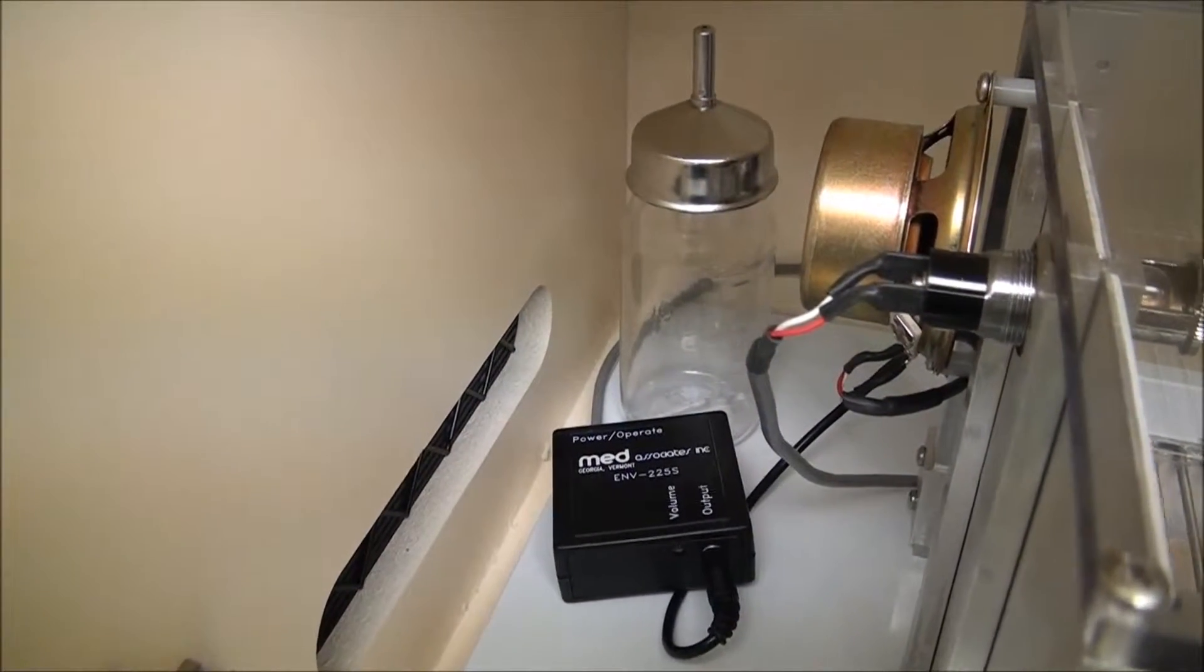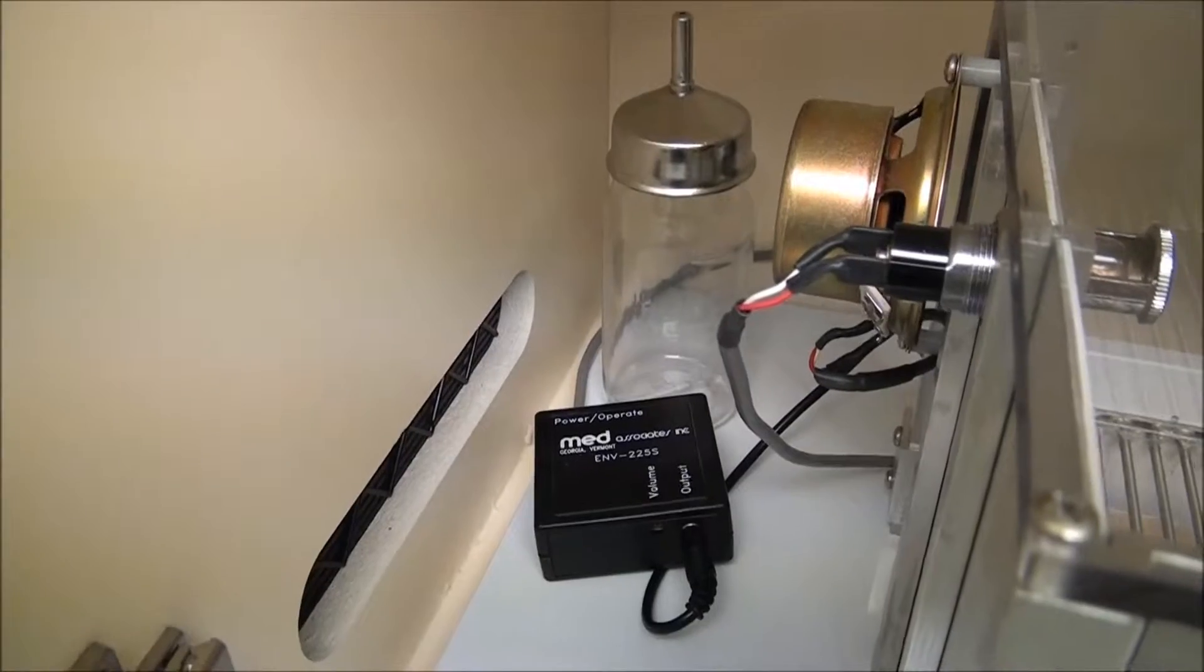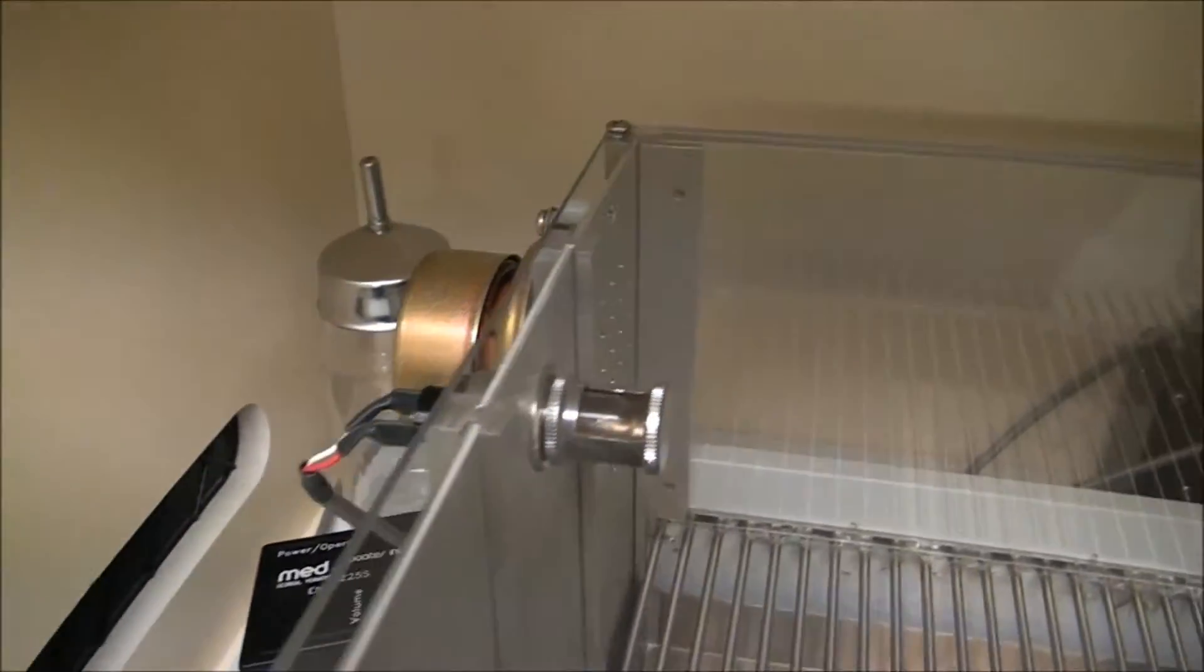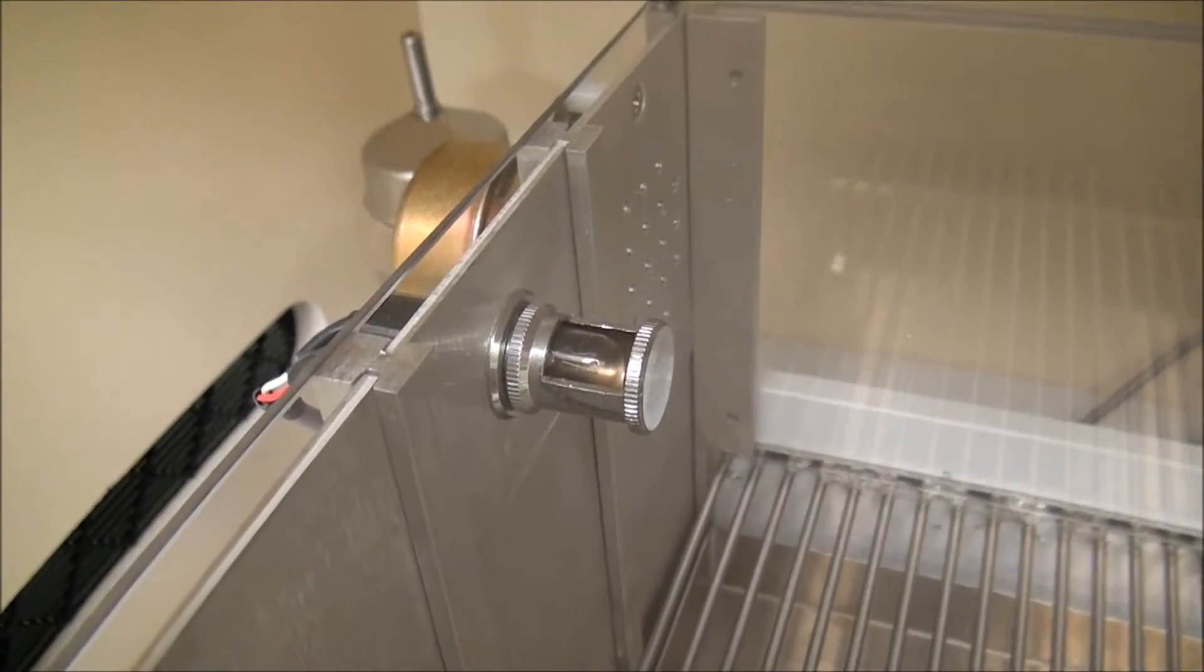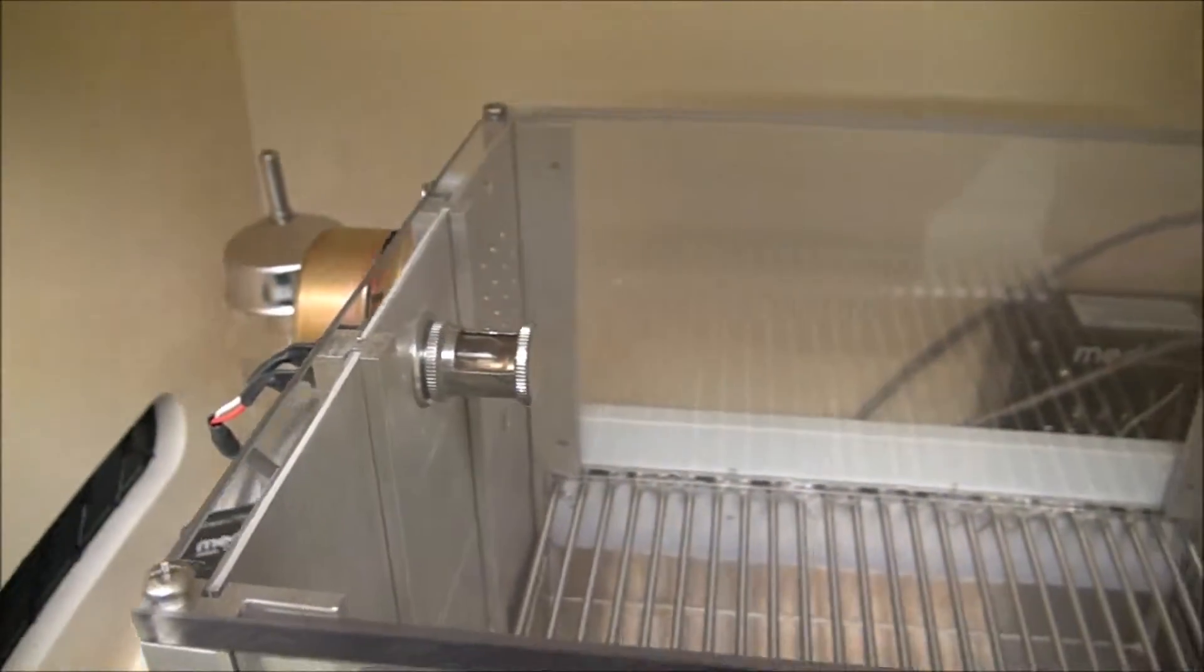So there's also the volume control built onto the box there. We can adjust it with a screwdriver. And then inside the chamber, you can see the house light that would be one of the outputs also.